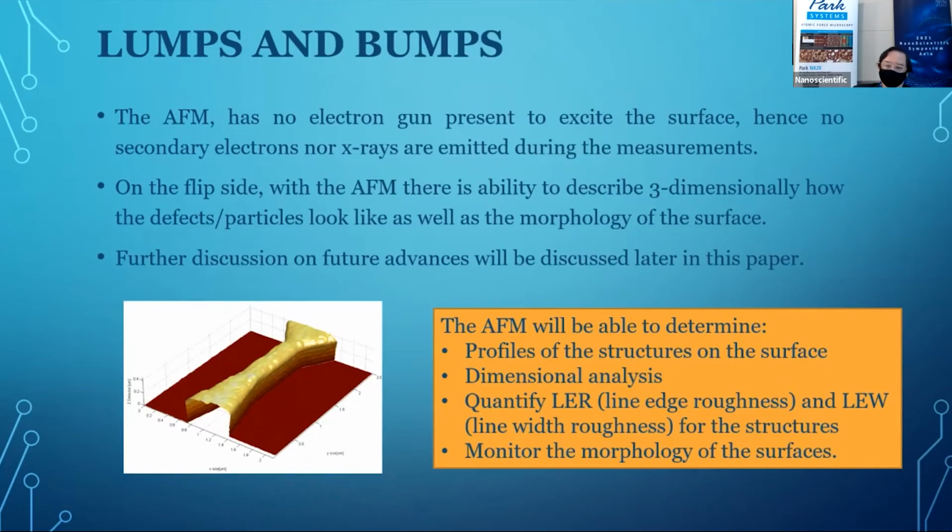So here lies the strength: I'm able to describe the shape and size in the SEM, but with the AFM, I'm able to have more pertinent details of the particle in question. However, in the latter part of this discussion, we talk about what advances are found to circumvent these particular issues of detection of the elemental or molecular structure.